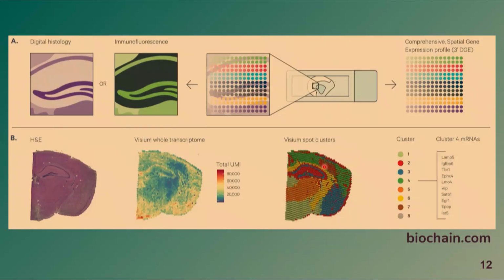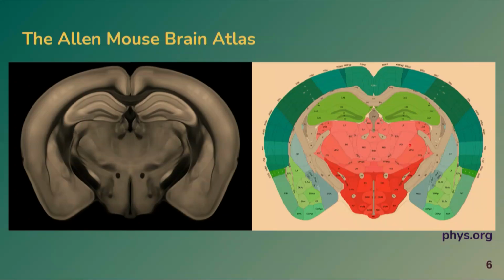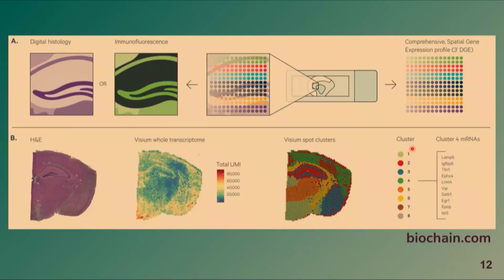And interestingly, this clustering made only from molecular data can reproduce biological structures like that without taking spatial information into account yet. So it's a very striking advancement.